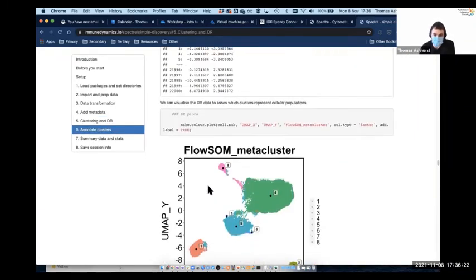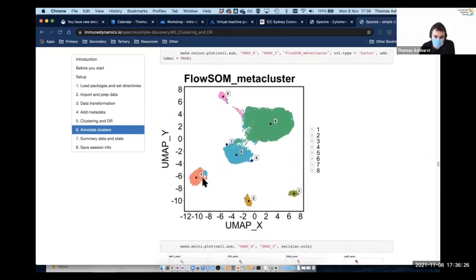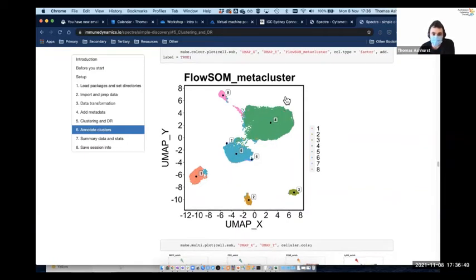The other thing to realize here is that we can see all these dots labeled by the cluster they belong to. The clustering is done by FlowSOM. That's a different algorithm. So the actual grouping of cells together is done using an algorithm that uses all of the dimensions, and then we simply plot that data in 2 dimensions. So they're 2 separate algorithms that work together in harmony, so to speak. That's basically the fundamental stuff.